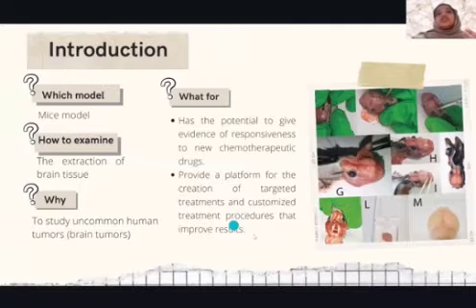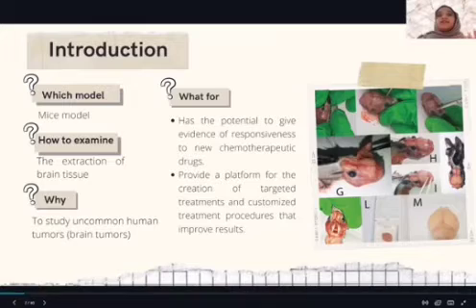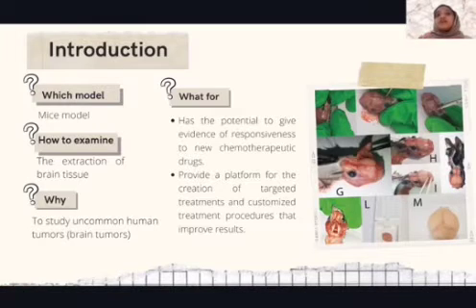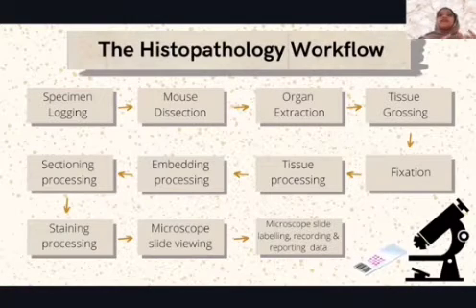Traditional histology tumor analysis may provide us a platform for the creation of targeted treatments and customized treatment procedures that improve results while reducing adverse effects. In general, brain tissue extraction from mice demands meticulous and precise techniques in the histological workflow.